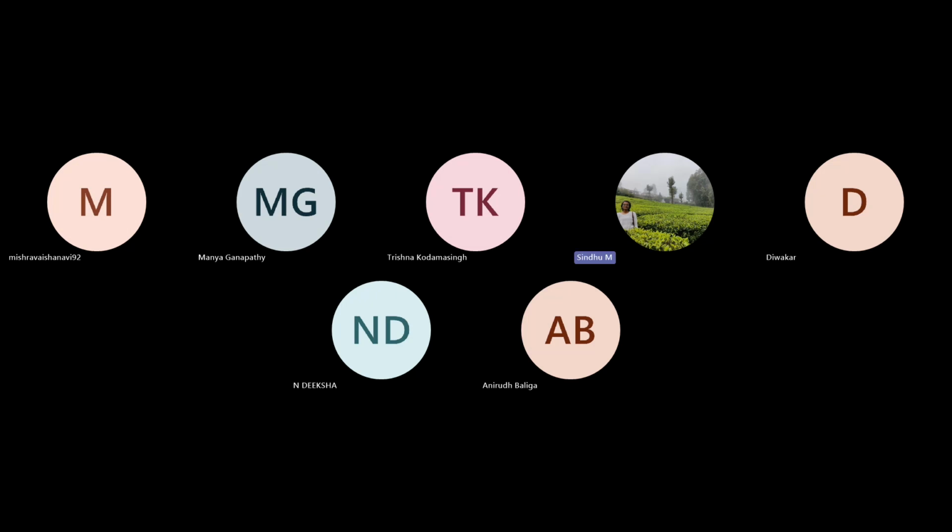This is the first channel, which has the cells, and this is the second channel, which has fluorescent beads. You can see that because I opened it from the CZI raw file, it already has the metadata, the pixel to micron conversion is already there, and it is a high resolution 16-bit image.